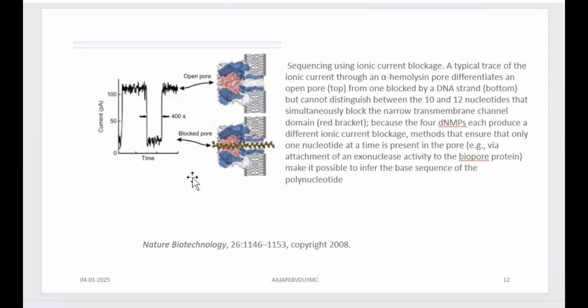When I say protein based nanopores, the problem is that they are extensively developed, no doubt, but being biological in nature, they have a limited shelf life. Then exposure to current and voltage may denature them over repeated use. So reuse potential is minimal.